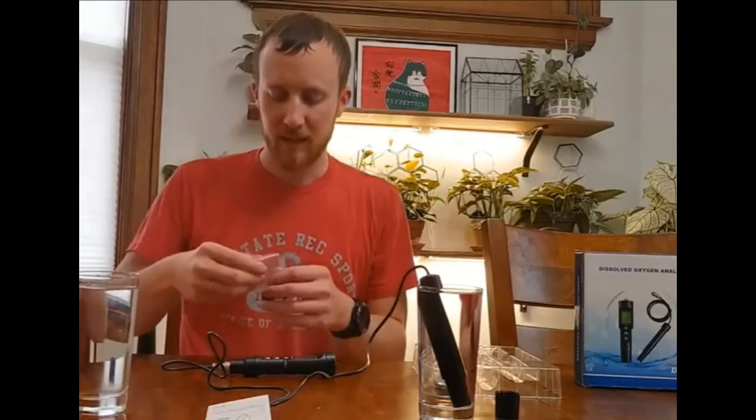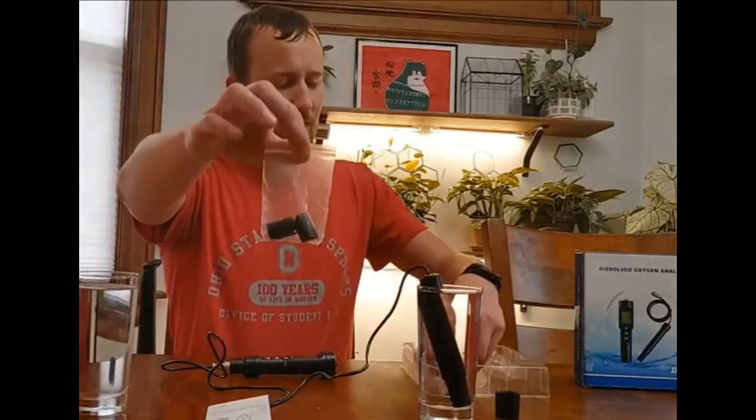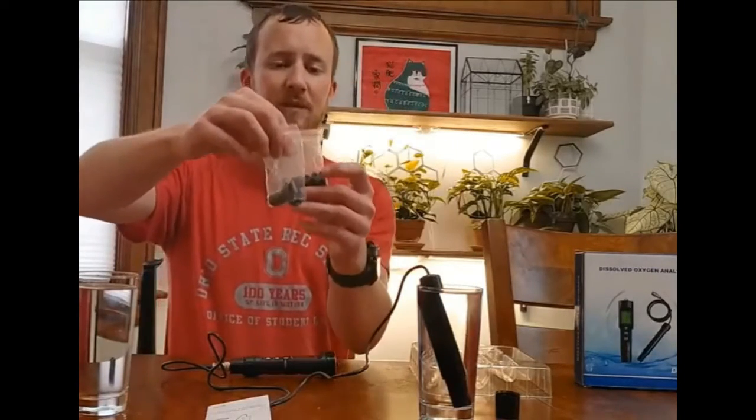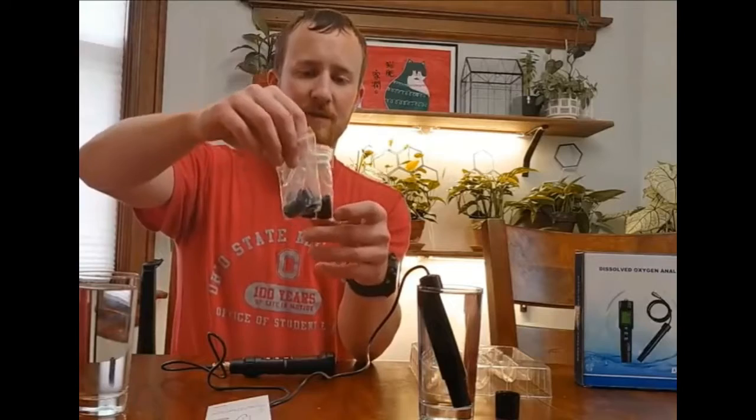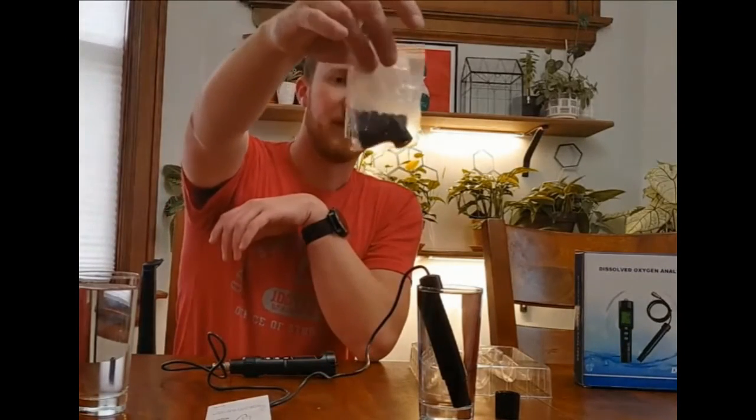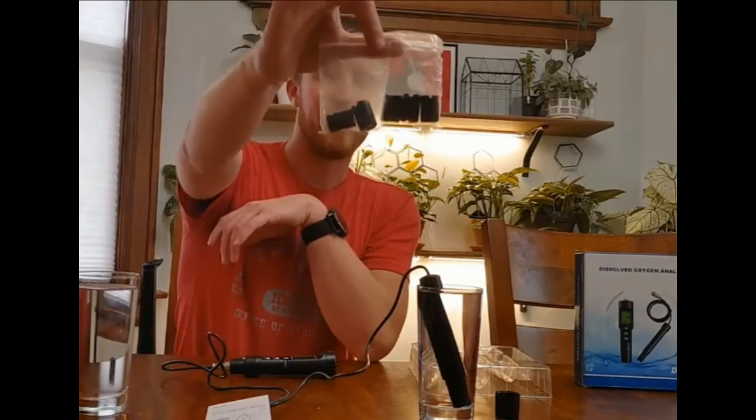All the other caps come in little plastic baggies. It does say to be careful not to press on the membrane. That's where the oxygen is going to transfuse through.